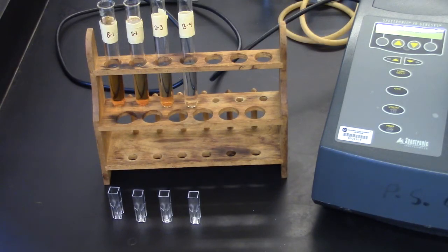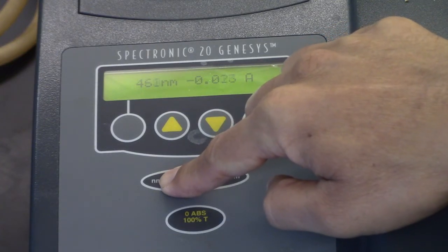there is 1,800 times more iron cations than thiocyanate anions, so this will push the equilibrium to the product side. Therefore, we can assume that all thiocyanate is converted to the complex. Use the same wavelength as in part A.